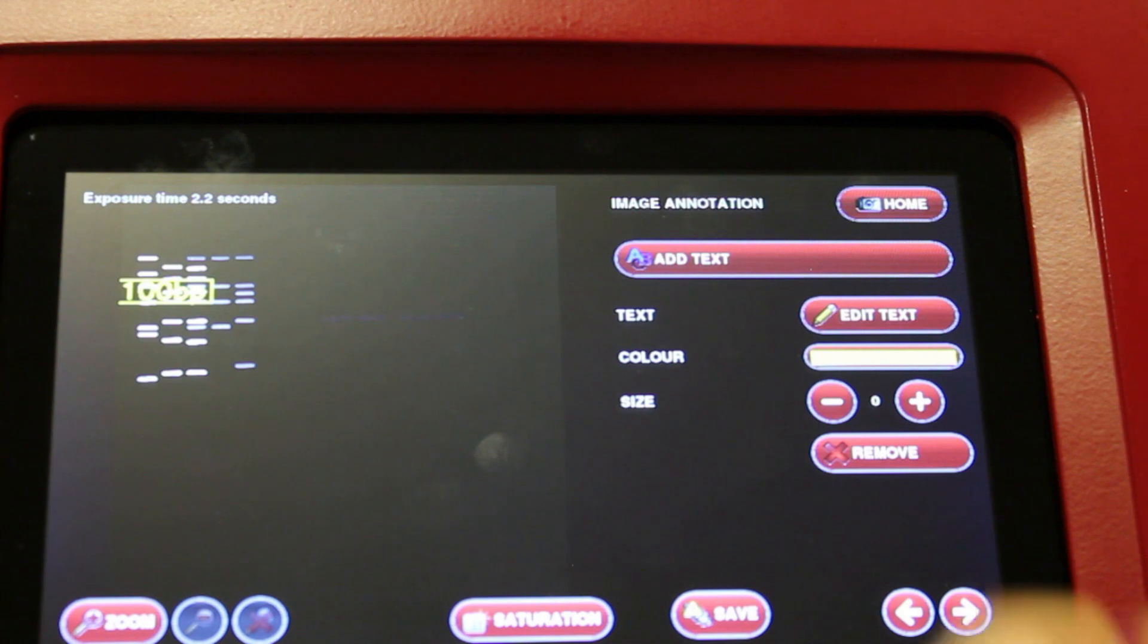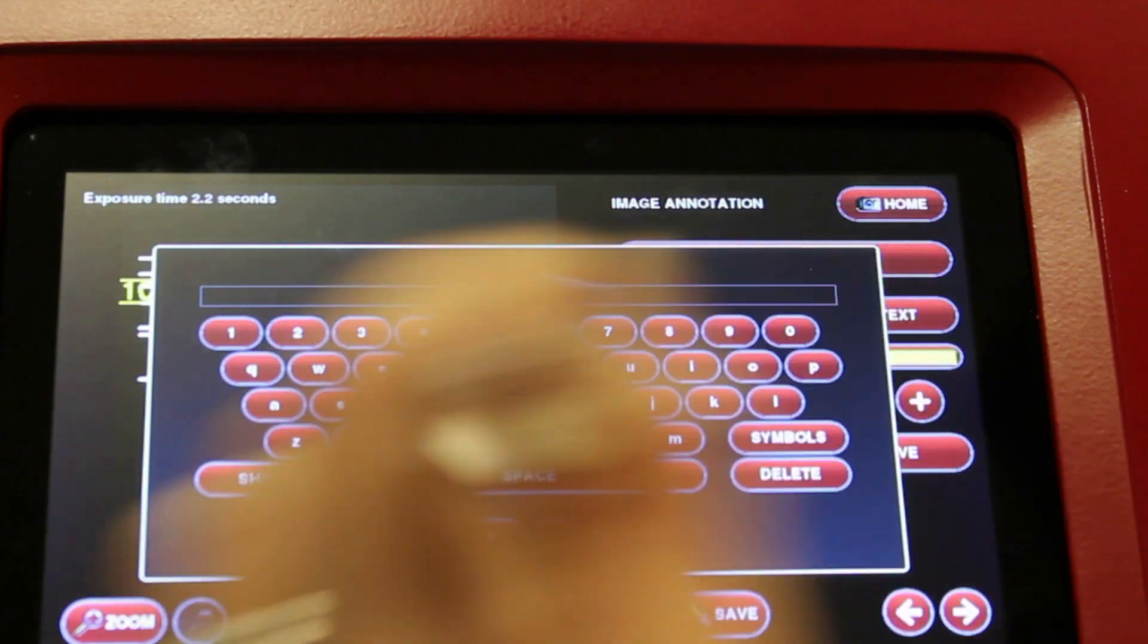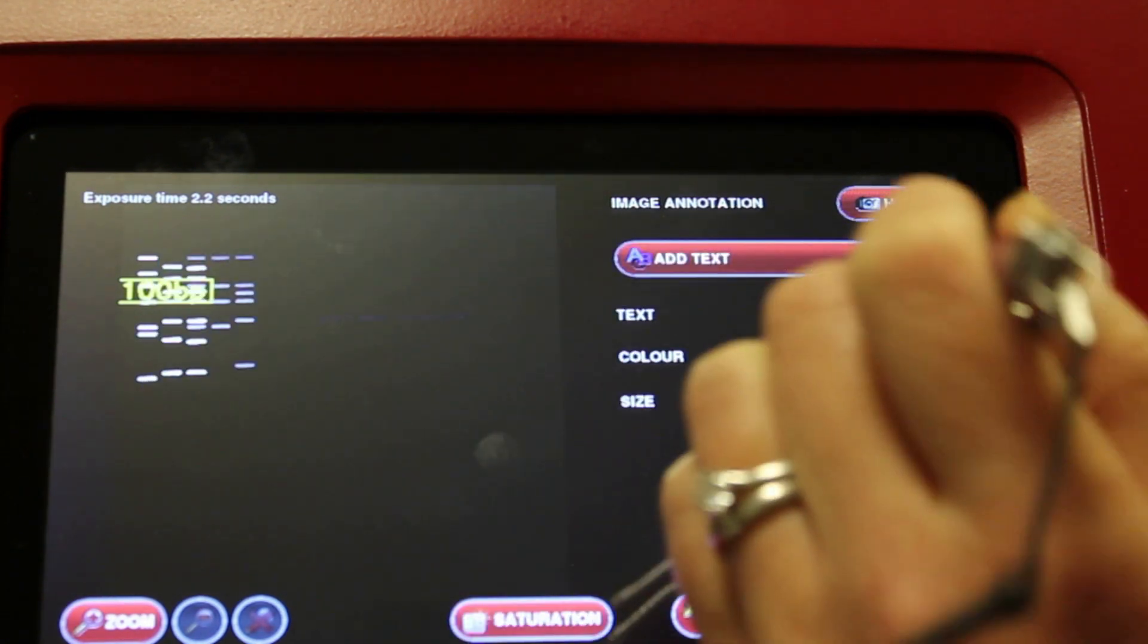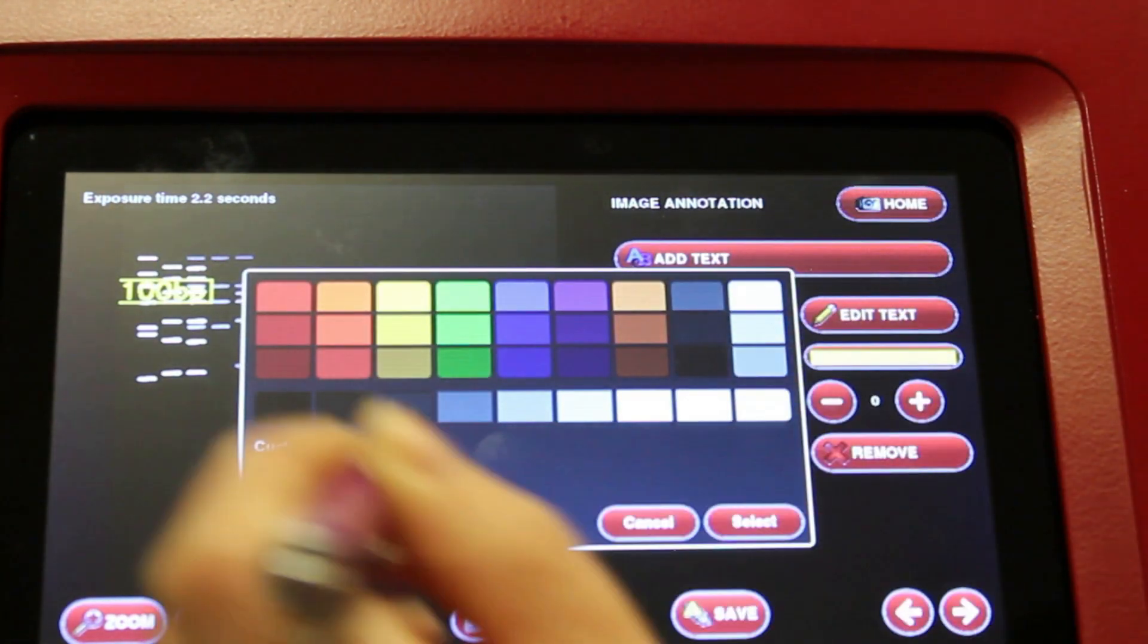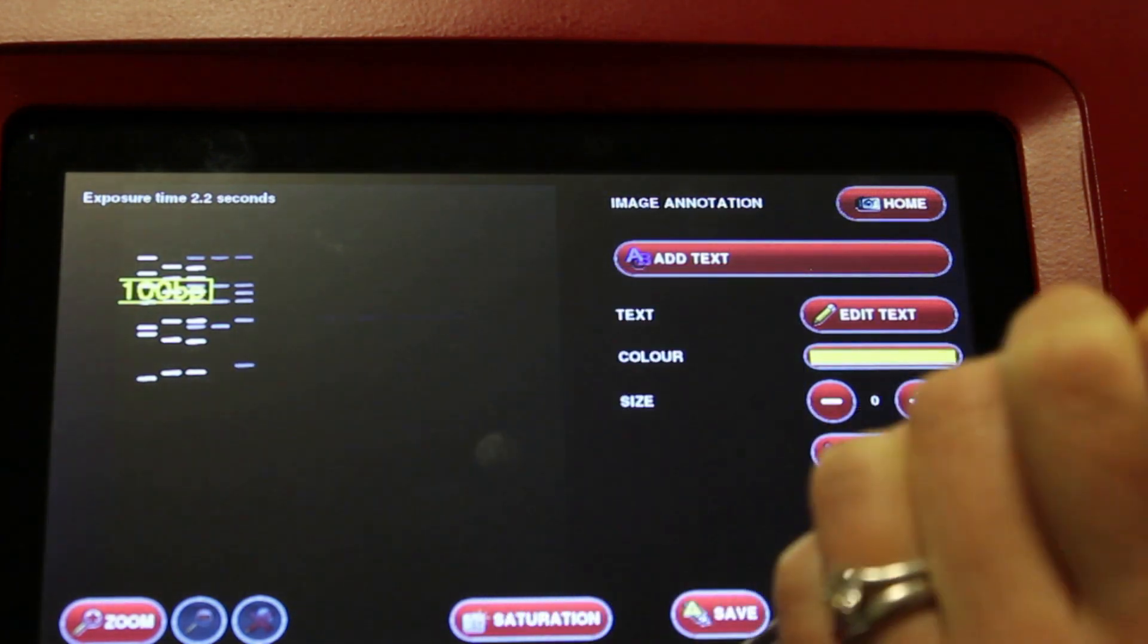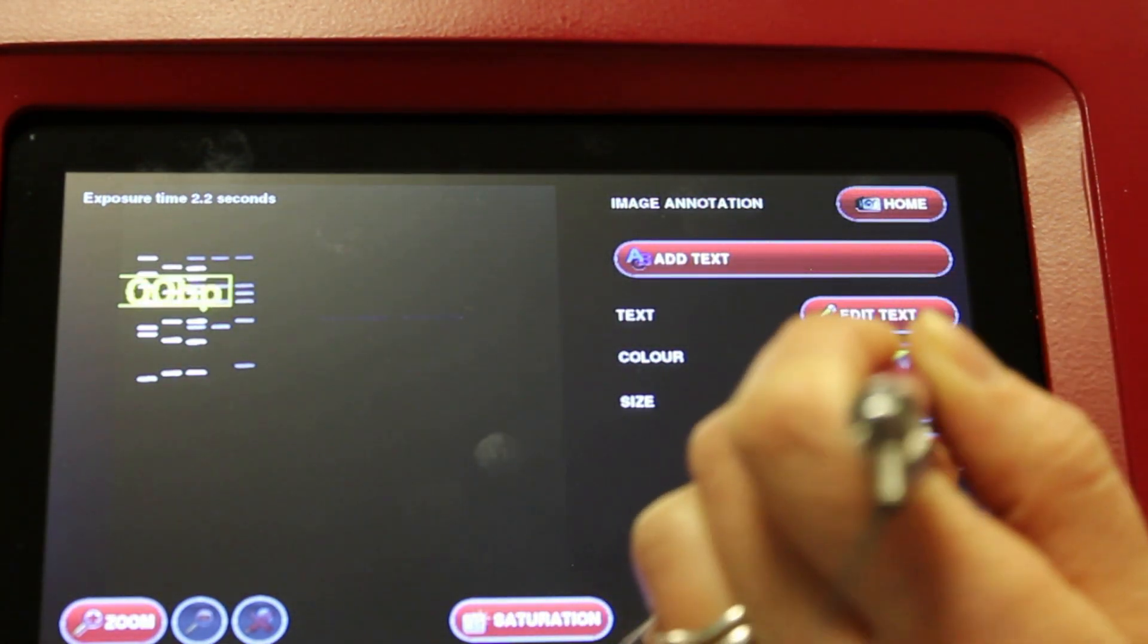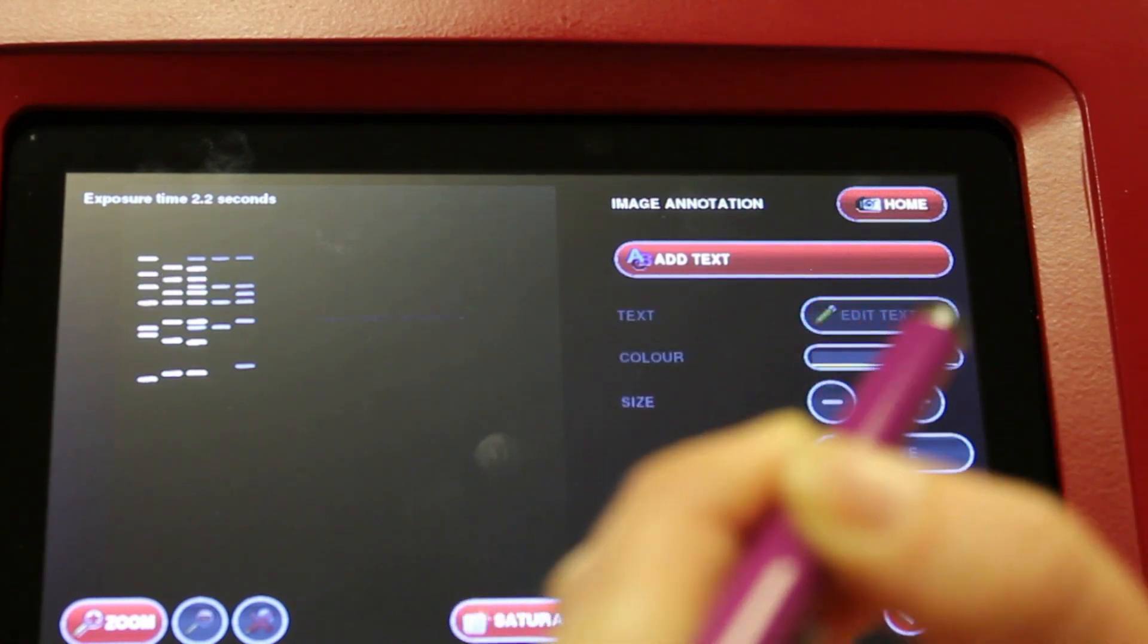You can also edit your text, so you can go back and change anything. You can change the color using the palette here. You can increase or decrease the size, and you can also remove text.